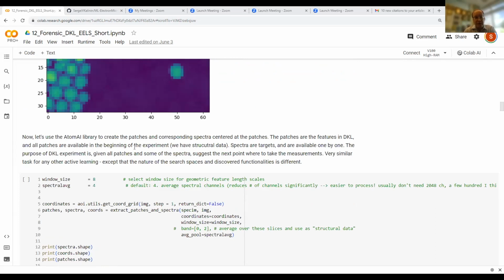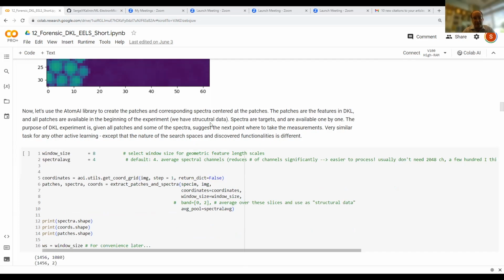The obvious way you can use this notebook for your own data would be to look at the data structure here and substitute the data object that we use by the data object that you want. That's how you can adapt it from STEM-ILS to CITS or AFM or EDX or any other measurement method.